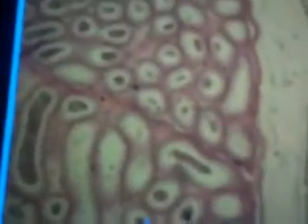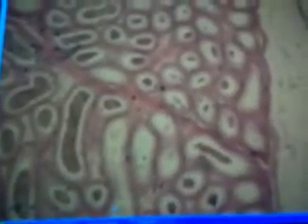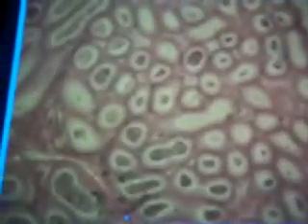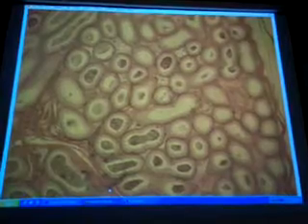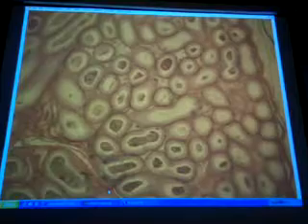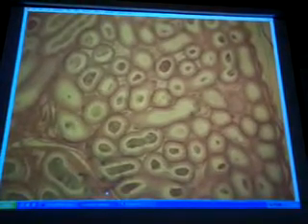Now, what is the structure? I removed it, but what is the structure inside the testes that makes the sperm? Seminiferous tubules. Interstitial cells are important. They do make testosterone. But a lot of students put seminiferous tubule for epididymis as a mistake. Oh, look, a bunch of cut tubes. Therefore, it's seminiferous tubule. No, it's not. It's different. It's the epididymis.